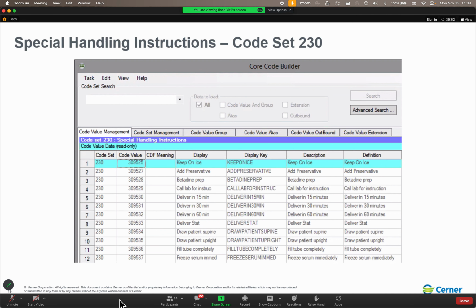I got one more question. Yeah, go for it. So the maximum length of the accession number, it looks like it's sequence length 6 and 7, so 13. Nope. No. For Julian, it is 6. Whoops, back up. And for Alpha, it's 7. Because the field that it's stored in on the back end stores the whole thing unformatted.